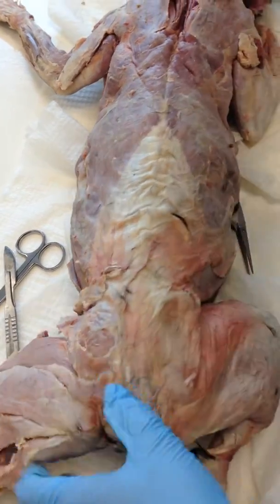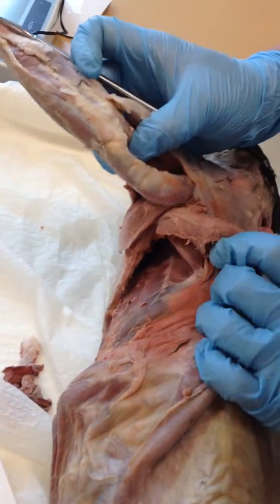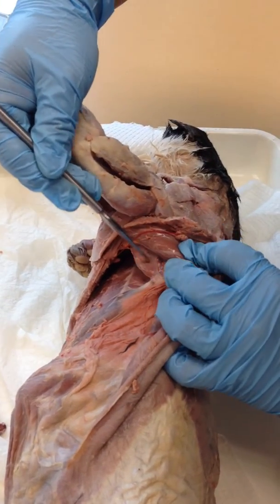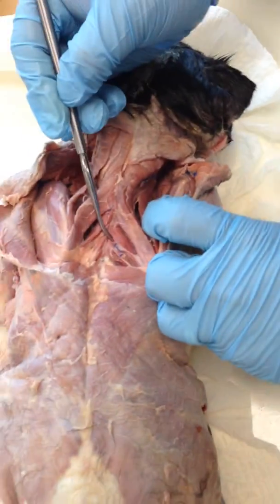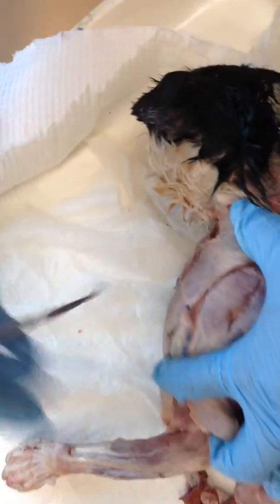The next one is the levator scapulae, which is all the way up here, right there. The infraspinatus is located underneath the latissimus dorsi, and it's right there. This is the latissimus dorsi, and that's the scapula. That's the infraspinatus, and then supraspinatus right there, and the rhomboideus is right there. Clavodeltoid is right there. That's the clavodeltoid right there.